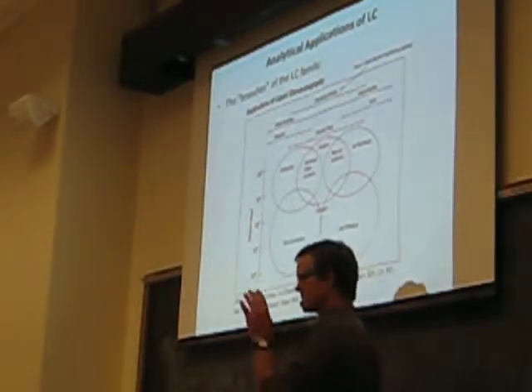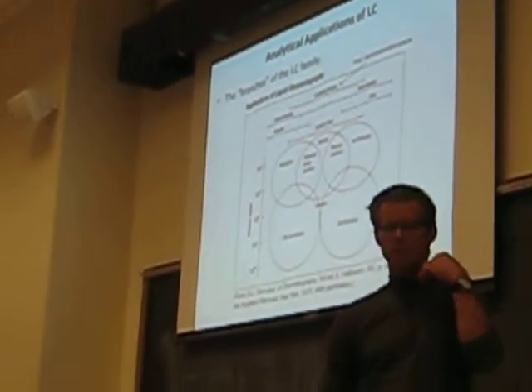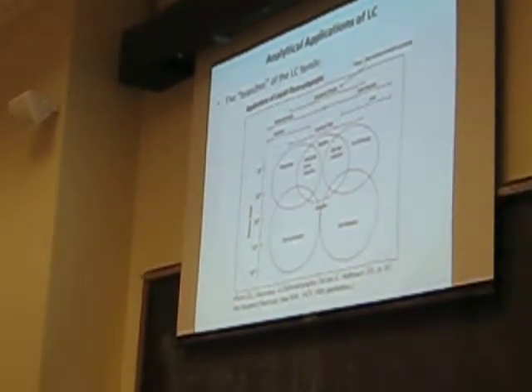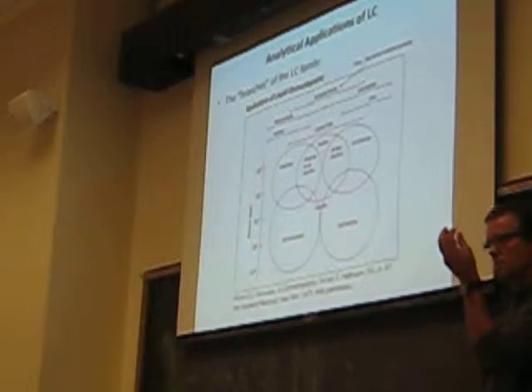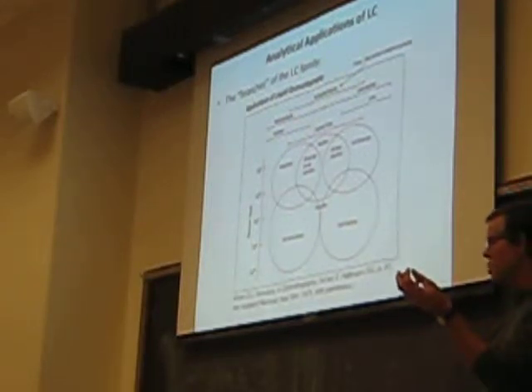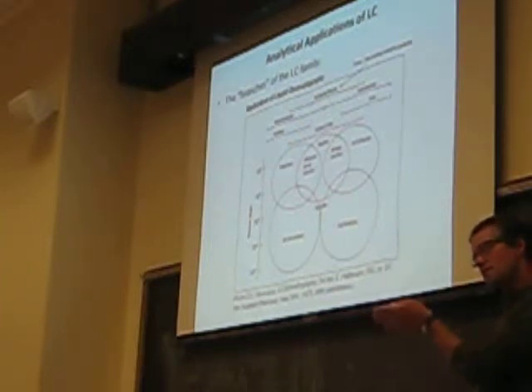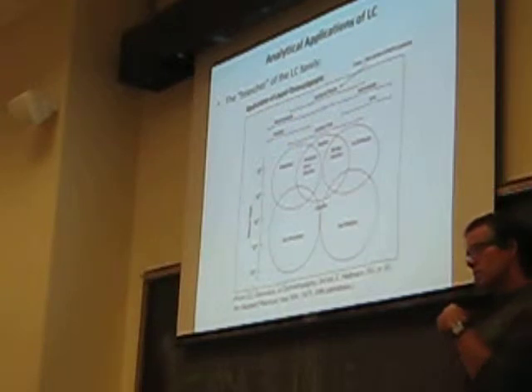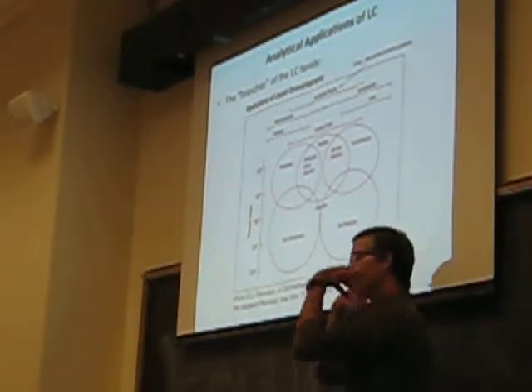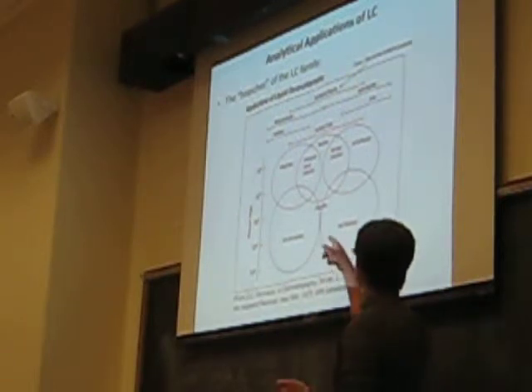And in fact, and this is a problem, in most size exclusion separations, sometimes there is a chemical interaction between the analyte and the size exclusion matrix. And that's a problem, because then you can't control that, and the relationship between size and elution time, or retention time, is altered, because you've got some other kind of interfering effect of chemical interaction with the material.